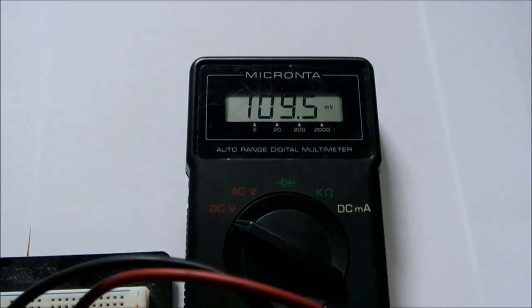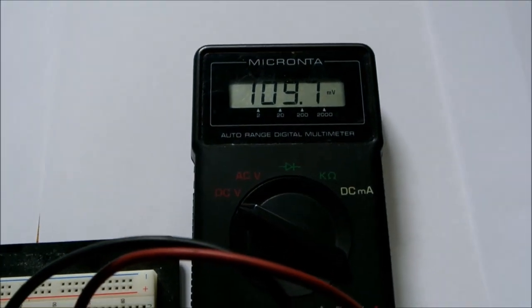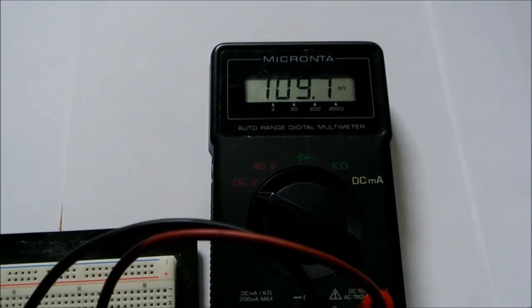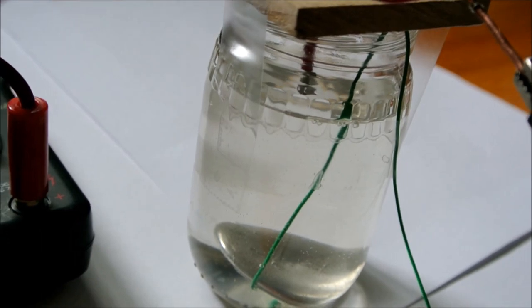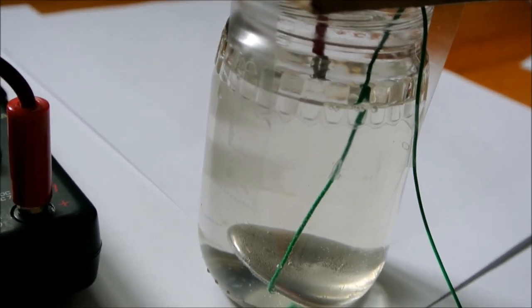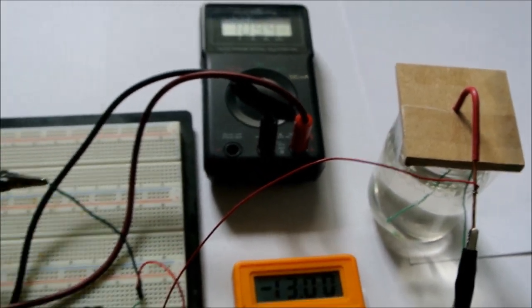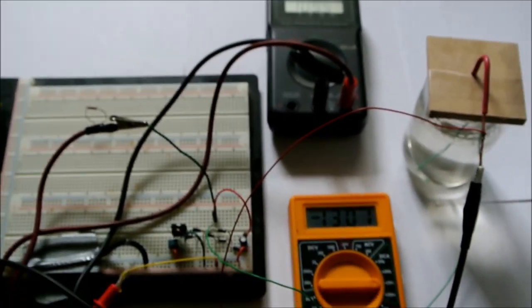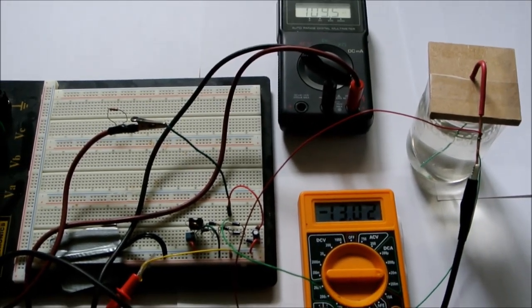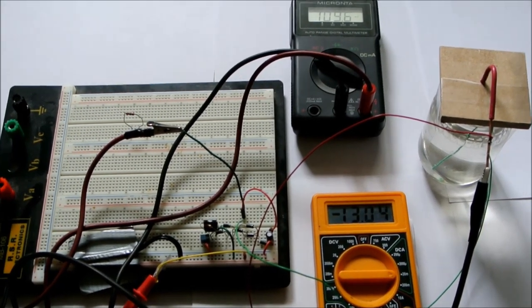This other multimeter is measuring voltage. It's pretty low under load, which is also fine. As long as tin is depositing, that's all good. And there is the crystal growing electrolyte bath. I will leave it for a few weeks, checking to make sure the current and voltage stay low, and it should grow a crystal.